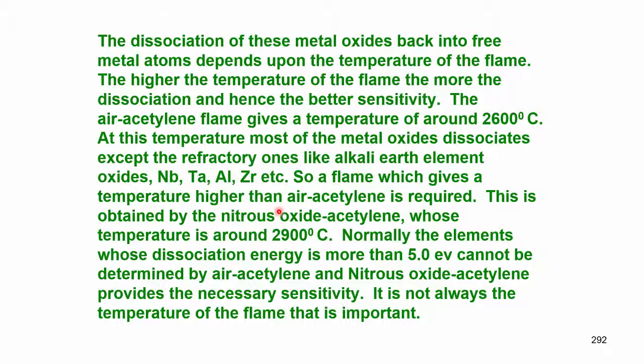That is nitrous oxide. Acetylene nitrous oxide is the one which gives you around 3000 degree centigrade.